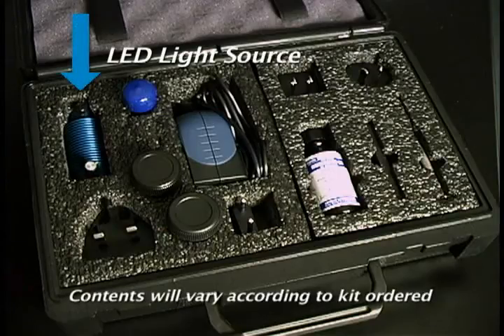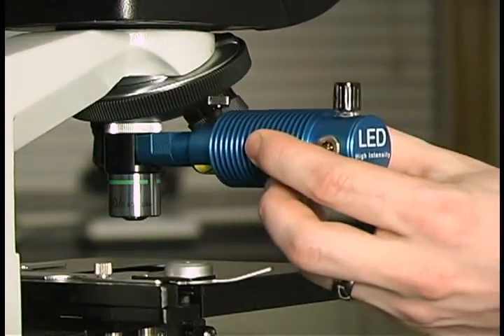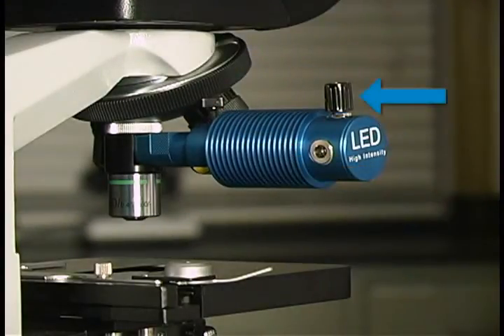The light emitting diode, or LED light source, slides directly onto the Paralyns Advance filter set arm and is secured by means of a thumb screw. An intensity knob, which is located on the top of the light source, allows you to increase or decrease the amount of light emittance.